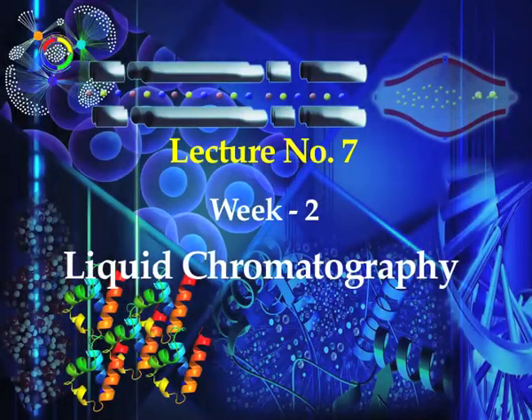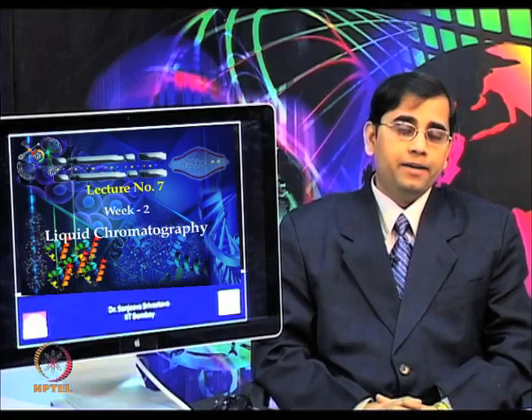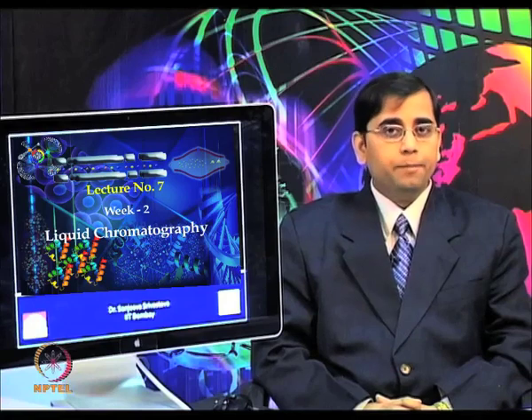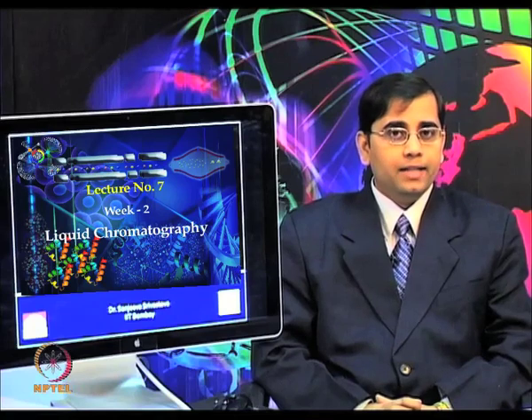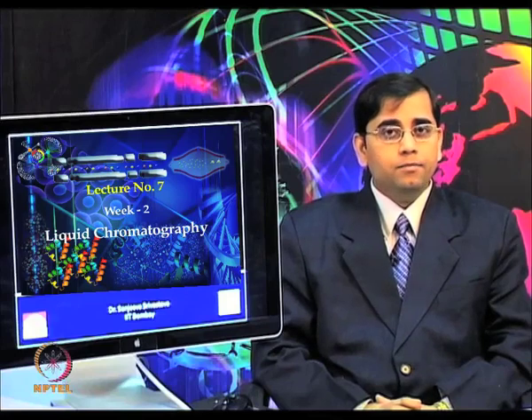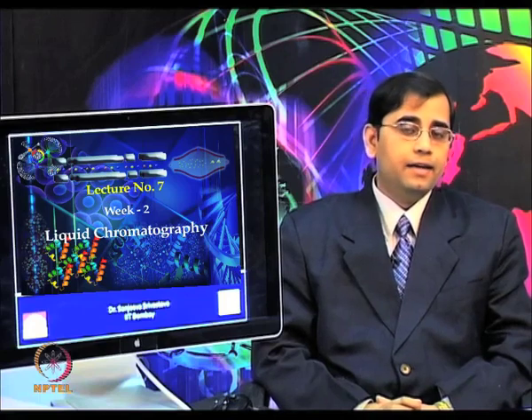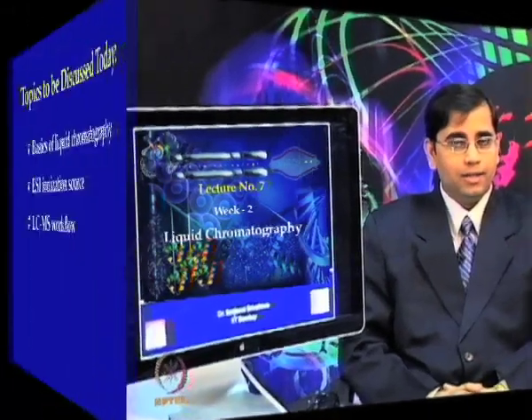Today we will talk about liquid chromatography mass spectrometry, or LC-MS. MS is based on production of ions, which are subsequently separated according to their m/z ratio. The resulting mass spectrum provides a plot of relative abundance of generated ions as a function of m/z. MS provides the most versatile platform and comprehensive analytical technique for the proteomic scientist for a wide variety of applications.